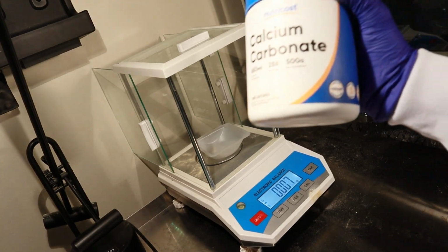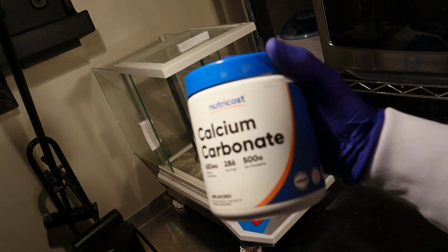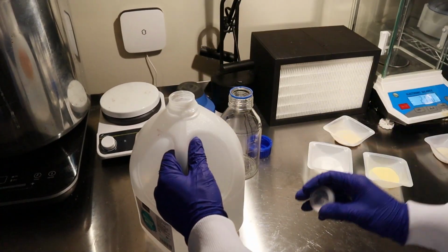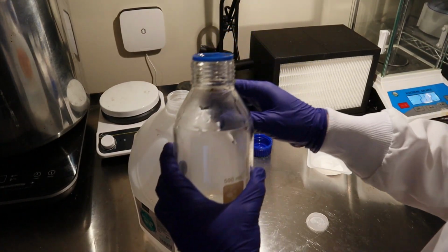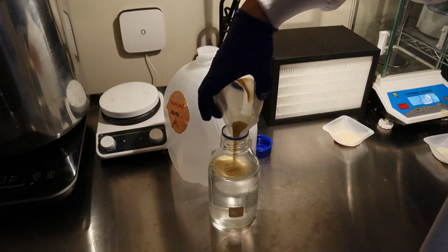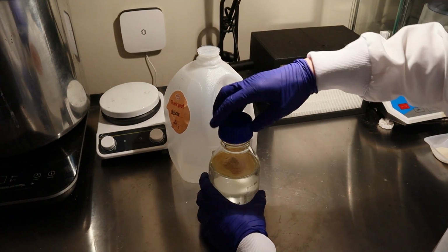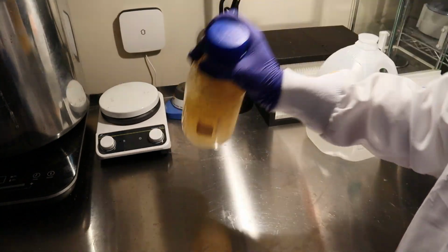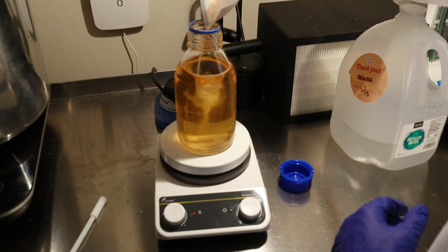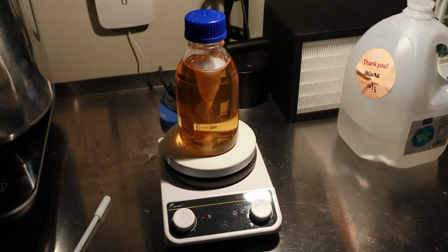The final ingredient was something to keep the pH balanced, which was 1 gram of calcium carbonate. After weighing everything out, I took a borosilicate media bottle, added 500 ml of distilled water, and poured everything but the agar-agar and calcium carbonate. I then tightened the cap and shook the bottle until everything was dissolved, and then added it to the hot plate with a stir bar and turned on the stirring. Once the solution turned clear, I added the final ingredient, calcium carbonate. Wait, no. I didn't. Oh.